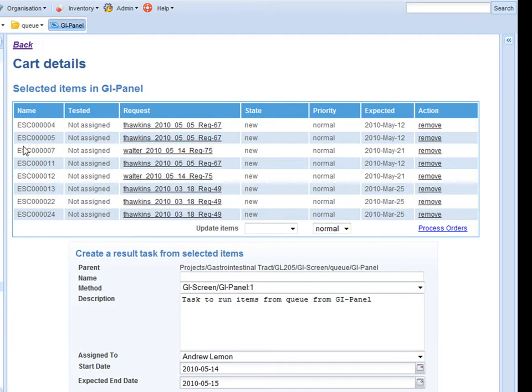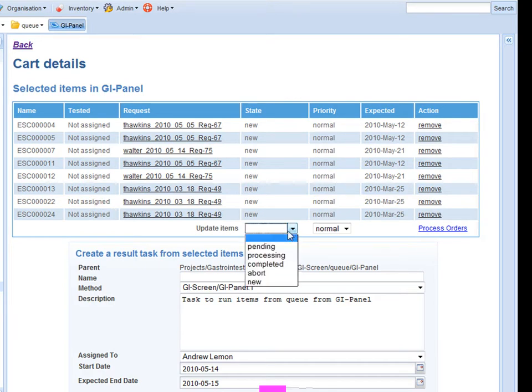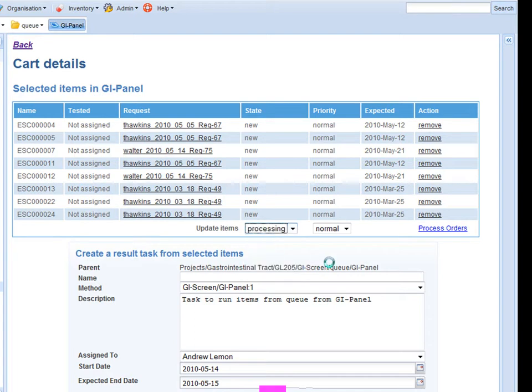I have now accumulated all of those different requests into one experiment. The first thing I am going to do is update the status of the request items.